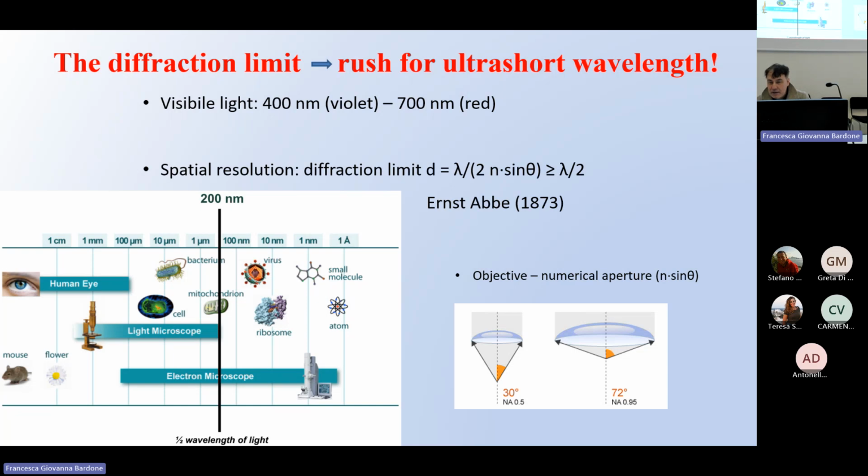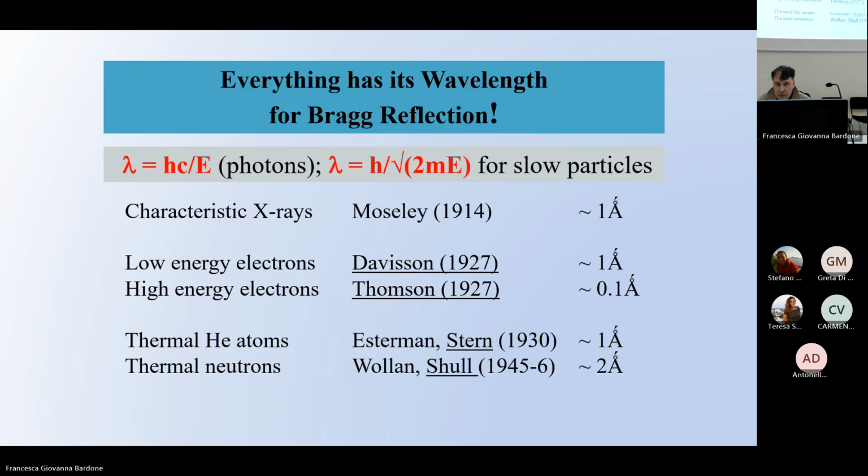But you need to create this type of instrument. And this is the reason for electron microscopy. The same thing I just told you before, with X-rays, you can have this type of resolution. Now with electrons, we can have this type of resolution. So we can resolve atoms in the solid.